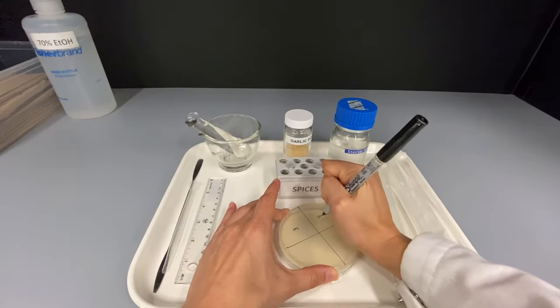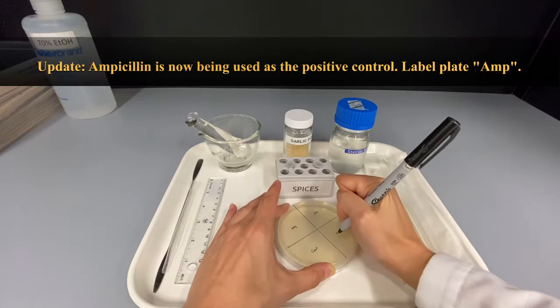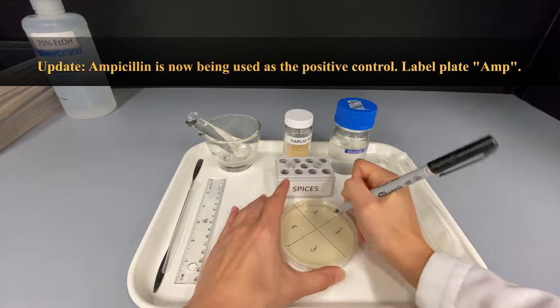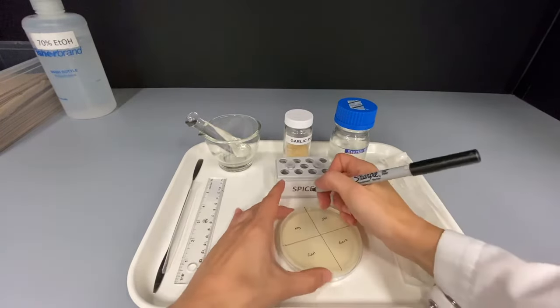For this experiment, you will have NEG for negative control, in this case sterile water, STR for streptomycin, your positive control, GAR1 for garlic concentration 1, and GAR2 for garlic concentration 2.